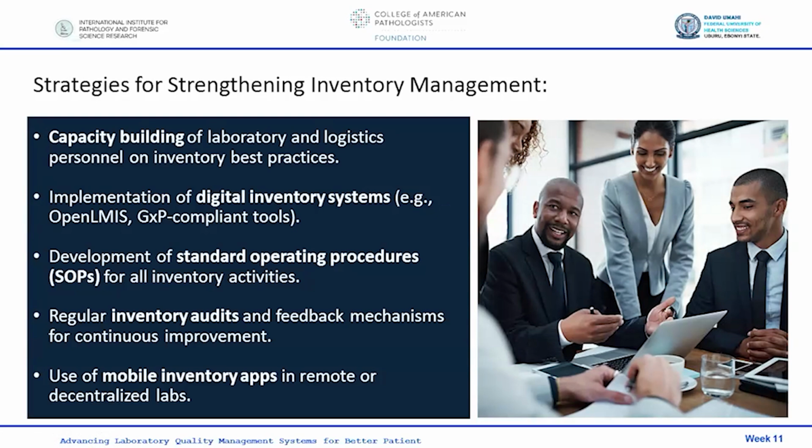Then it is important to also develop standard operating procedures for all inventory activities. So think of all inventory activities, all of them, they need to have an SOP. Another one is regular inventory audits, like I've mentioned, and feedback mechanisms or loop, because these feedback mechanisms and regular audits help for continuous improvement. It is important to also consider use of mobile inventory apps in remote or decentralized labs.